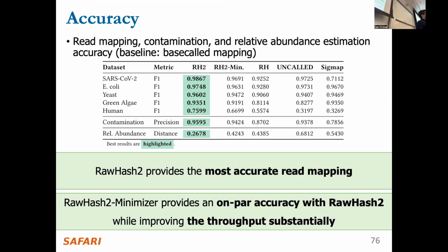One quick version of this is that when you were talking about accuracy rates, the human genome is harder, and for many reasons it's legitimately harder. You talked a little about the potential for integrating this with other approaches. Have you been doing a short and long read version, or something else, to get accuracy up on human-scale problems? What else have you been doing? Maybe you can just talk about that number a little, because that's discouraging.